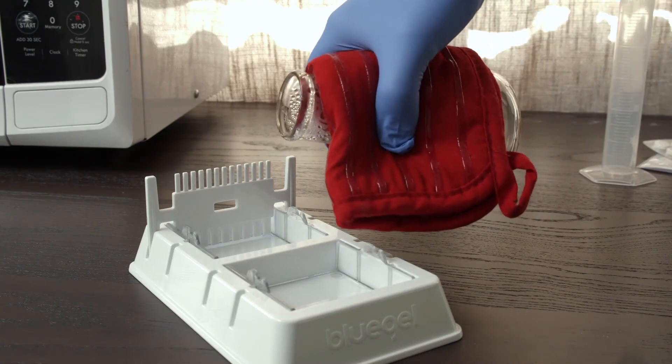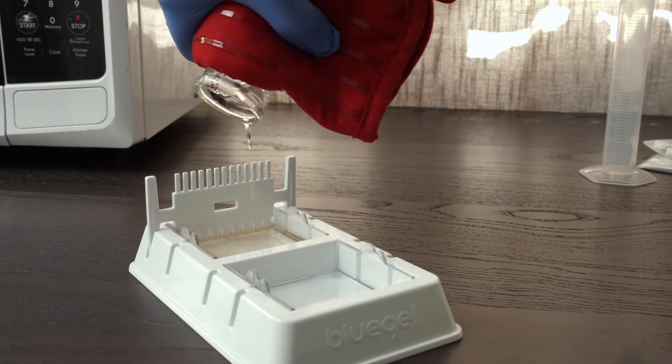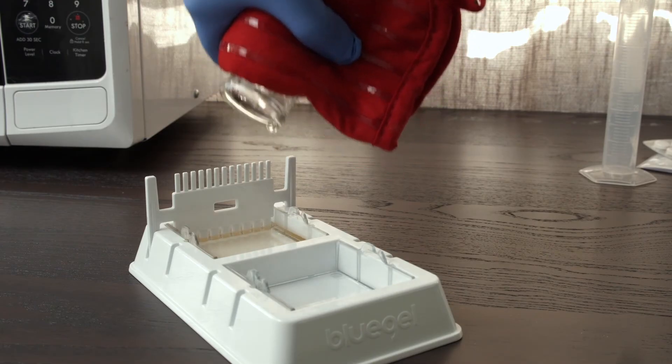Pour the gel into assembled gel casting trays. Make sure you have inserted the combs to create wells. The gel will set in about 10 minutes. Once cooled, it should feel firm like jello.